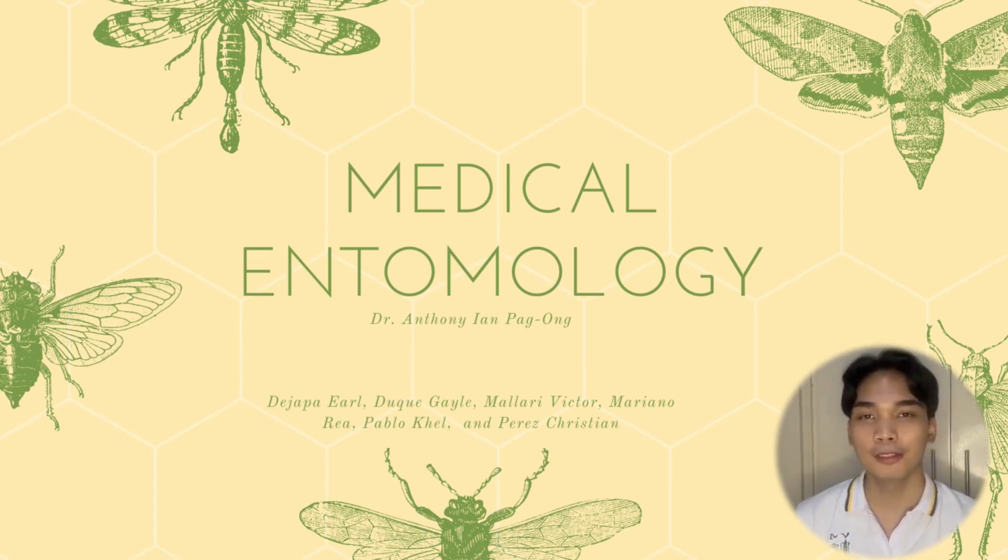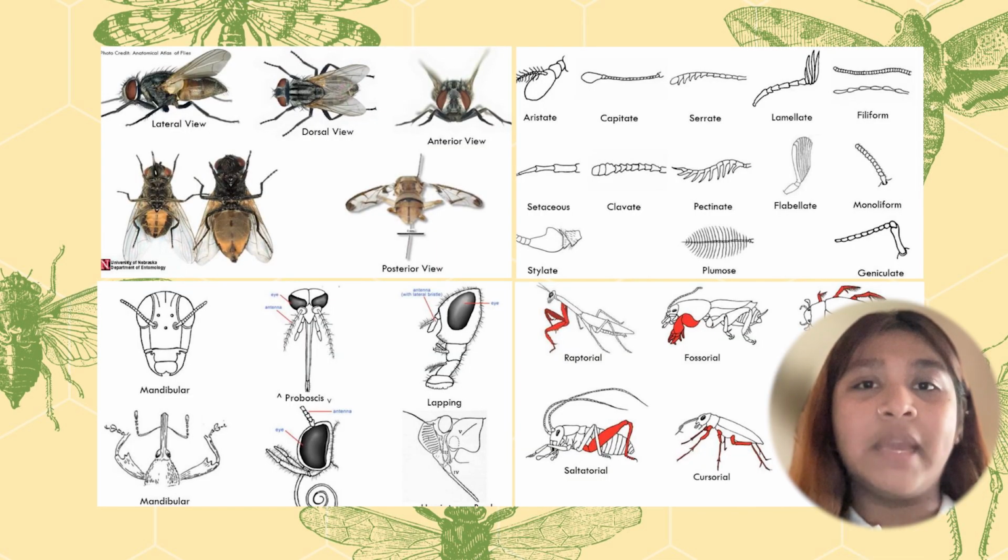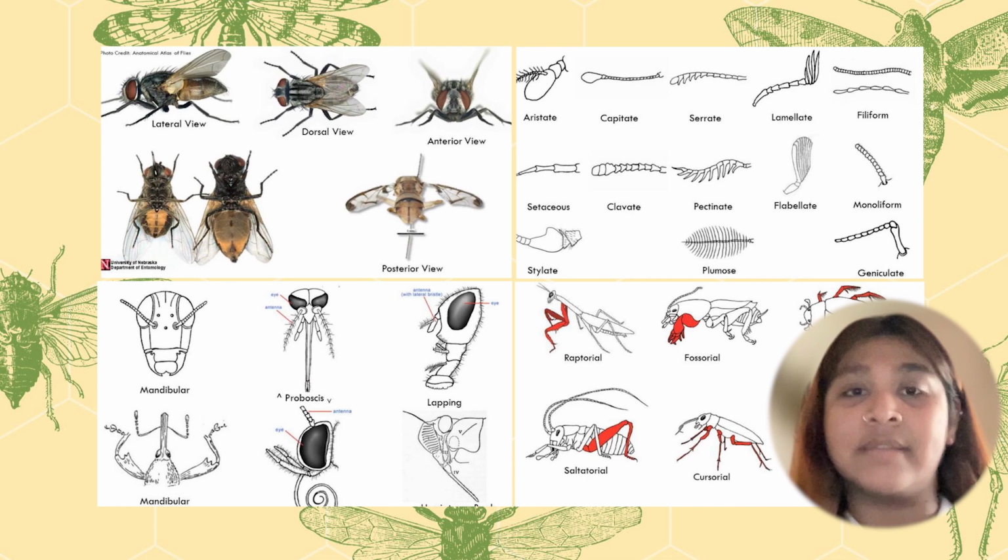Good day, everyone. Today we investigated the fascinating field of medical entomology, and we have an interesting tale to share. We began in our first laboratory exercise by studying the internal and external parts of insects and arachnids and their functions. We started with the antenna, which was a fascinating feature. We learned that insects have many different forms of antennae, and they also have various functions.